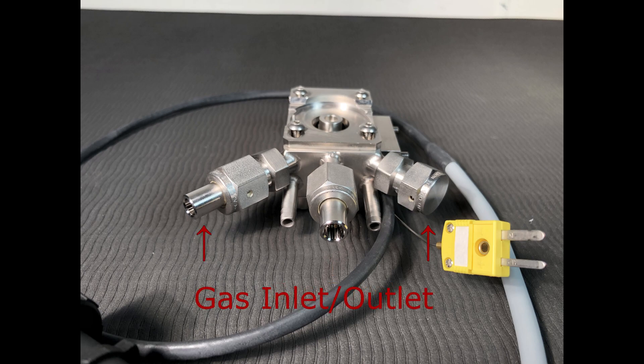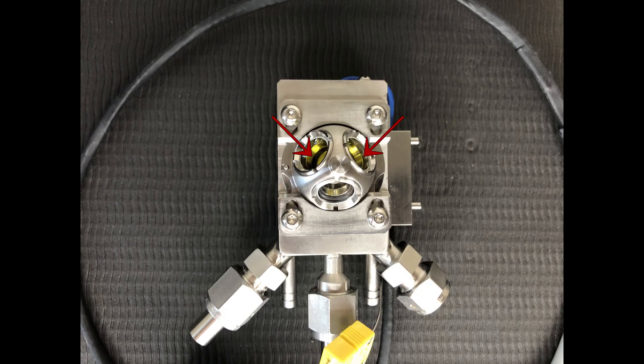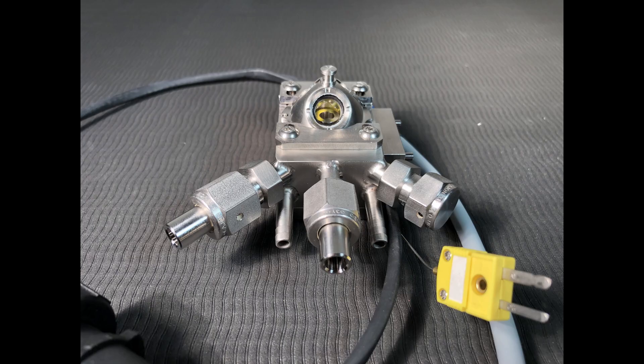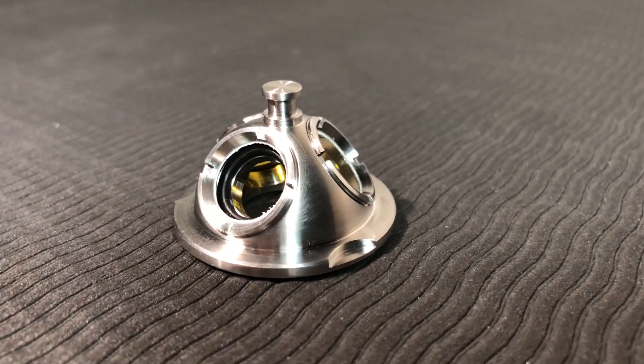One of the ports leads directly under the sample cup, while the other two lead into the sides of the chamber. The chamber is enclosed with a dome with three windows: two for the spectrometer radiation to enter and exit the chamber, and a third for viewing, illuminating, or irradiating the sample, enabling use for photochemical studies. For IR operation, the standard material for the observation window is UV quartz, while the other two windows use potassium bromide and zinc selenide. For UV-Vis operation, the standard material for all three windows is UV quartz.